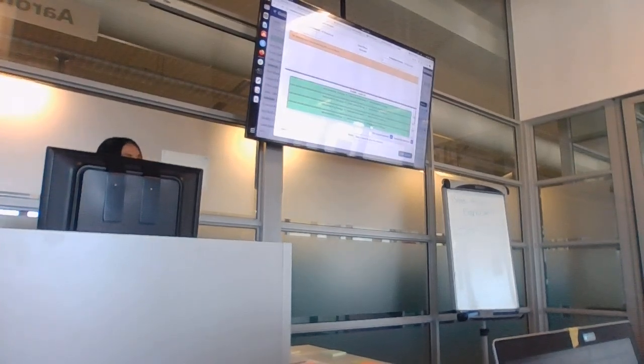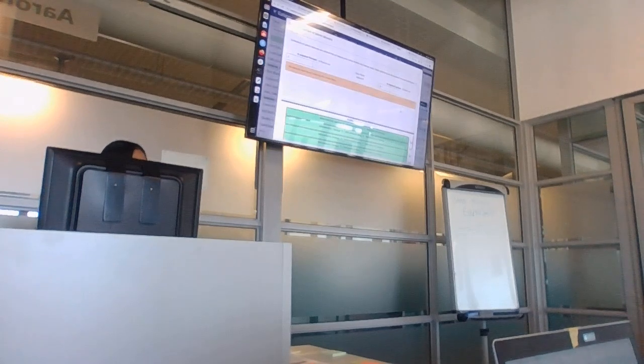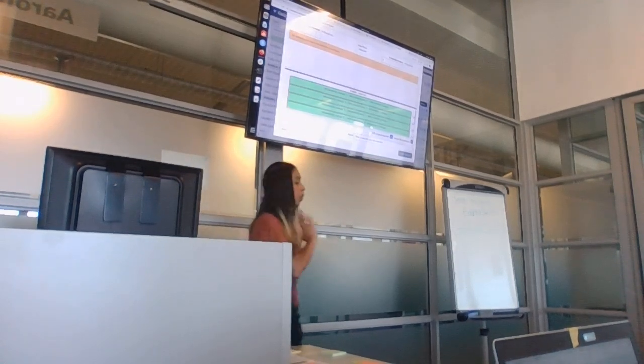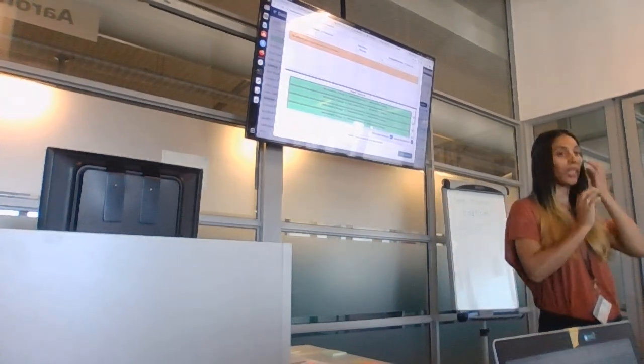When you do that, this box will appear. If you don't see this box, put up a sticky note, a red one. Now, the worst part sometimes about clean data is that you don't learn much.